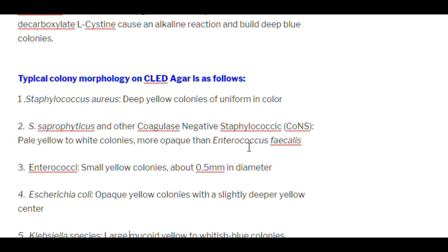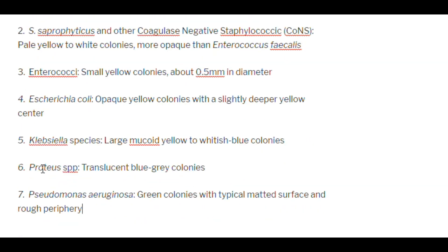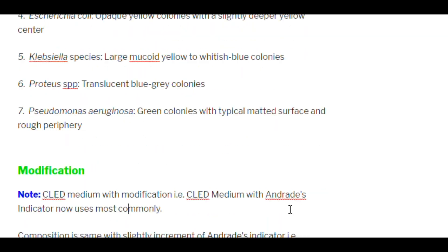Typical colony morphology on CLED agar: Staphylococcus aureus produces deep yellow colonies, uniform in color. Staphylococcus saprophyticus and other coagulase-negative staphylococci produce pale yellow to white colonies, more opaque than Enterococcus faecalis. Enterococci produce small yellow colonies about 0.5 mm in diameter. Escherichia coli produces opaque yellow colonies with a slightly deeper yellow center. Klebsiella species produce large mucoid yellow to whitish-blue colonies. Proteus species produce translucent blue-gray colonies. Pseudomonas aeruginosa produces green colonies with a typical matted surface and rough periphery.